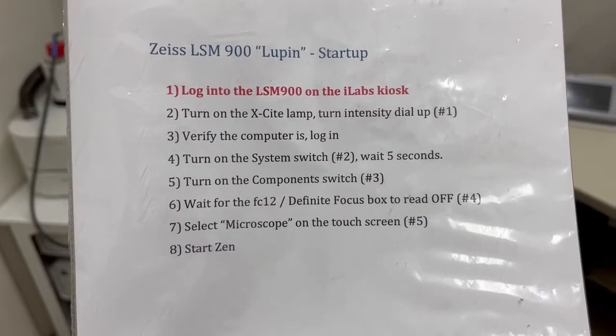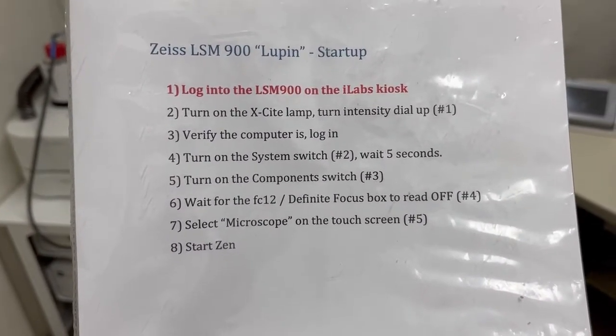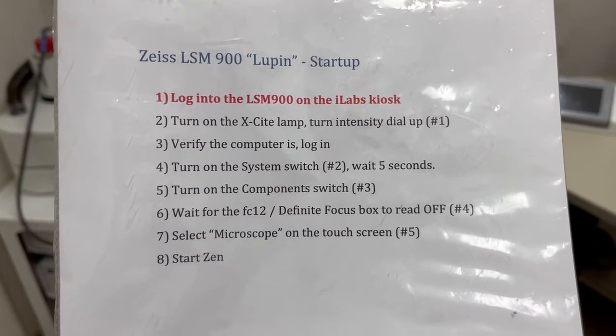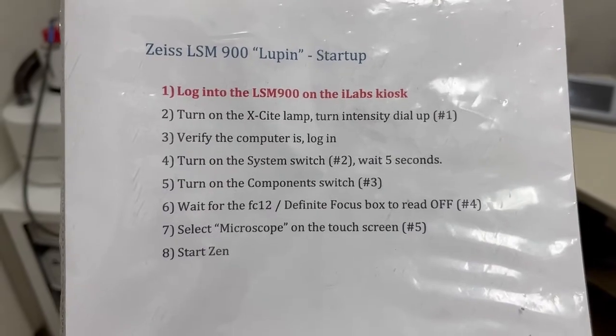The first step is to log into the LSM 900 on the iLabs kiosk — I've already done that. The second step is to turn on the excite lamp and turn the intensity dial up. That's switch number one.